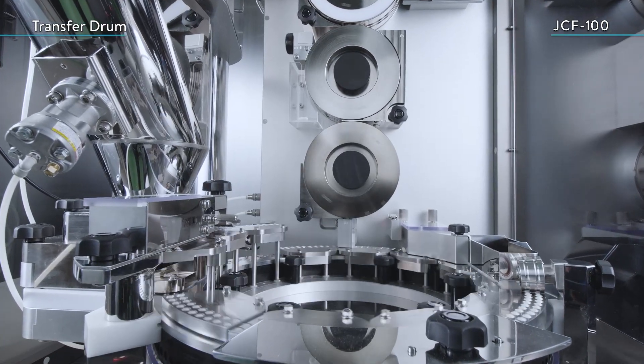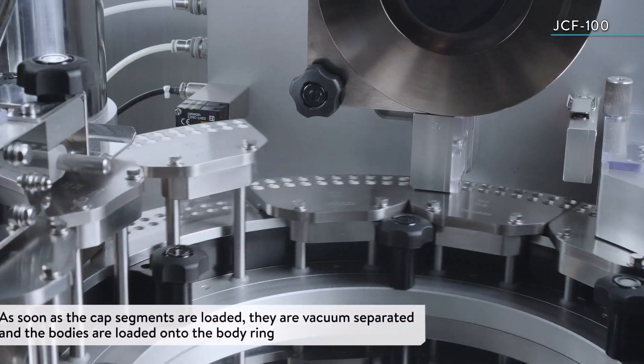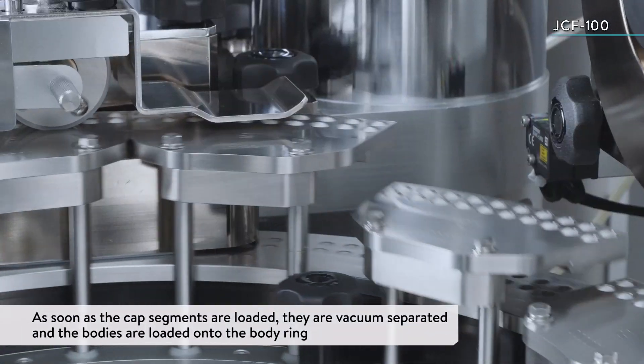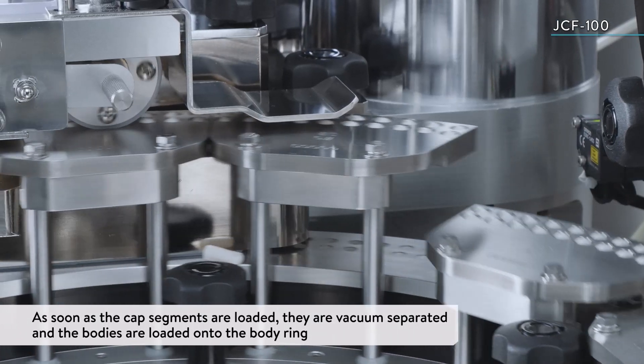The capsules aligned in the transfer drum are vacuum-separated while being loaded into the cap segments, and the bodies are loaded onto the body ring.